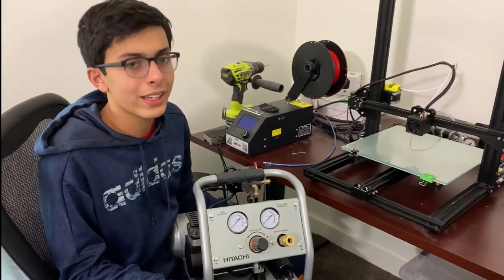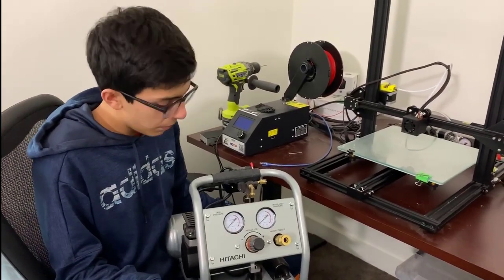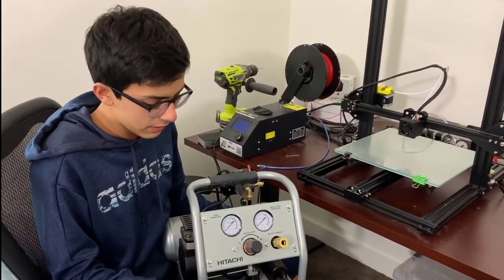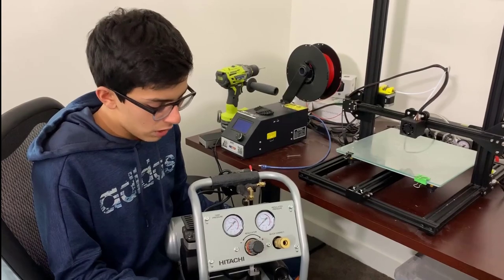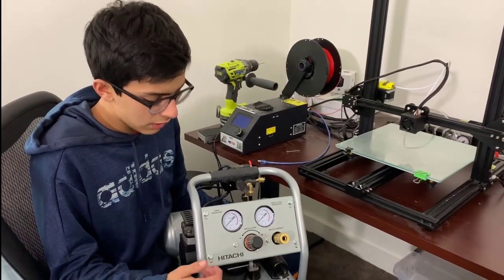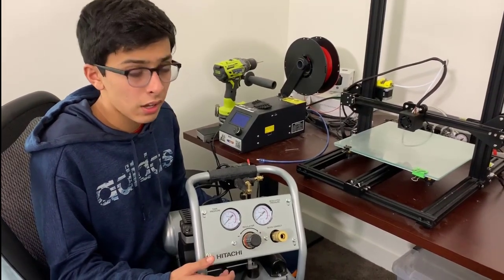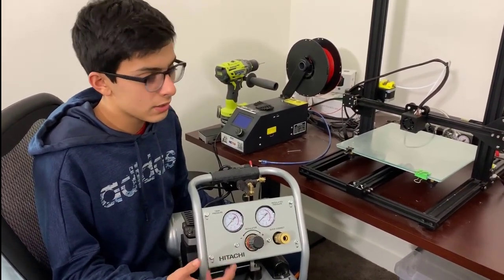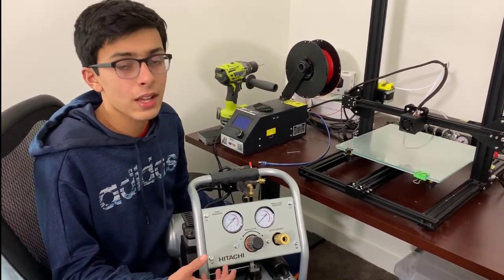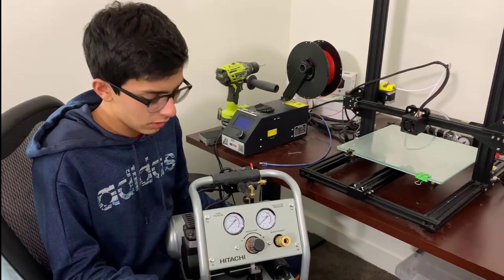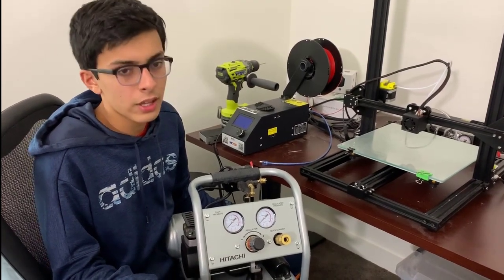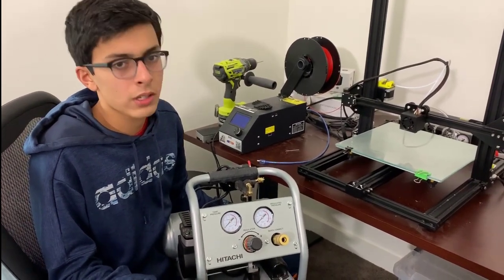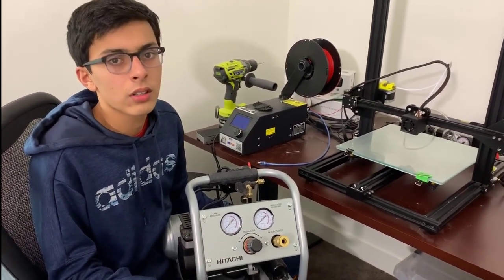We will also be using an air compressor to power our pneumatic system. We chose to use the Hitachi air compressor due to its small size and because it's not super noisy, but any air compressor should work.